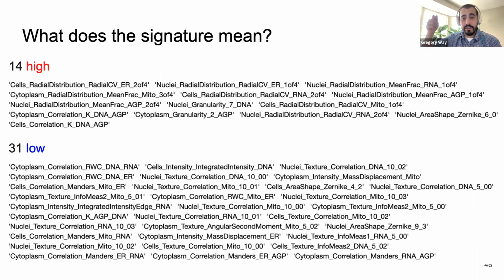You can definitely use these approaches in tissue. Segmentation becomes more challenging, and cell type annotation also becomes challenging, though you might not need to do it in every case. The data are typically larger. I haven't had much experience analyzing tissue data, but I'm sure some of the challenges we've overcome in 2D cell culture might translate to the tissue space. But I imagine there's also going to be a whole set of unique challenges. Right. Okay. Thank you.